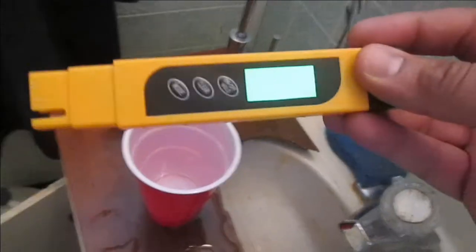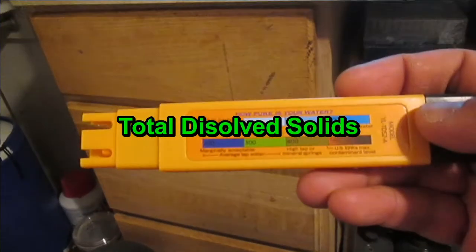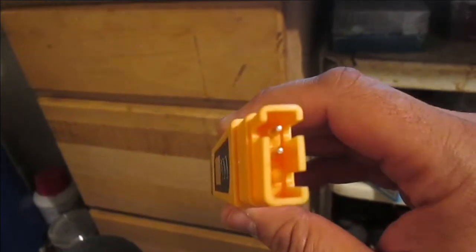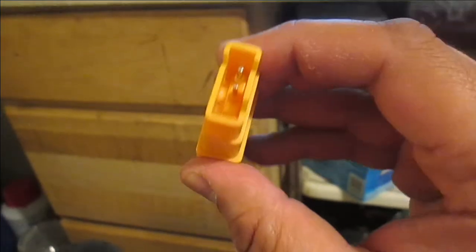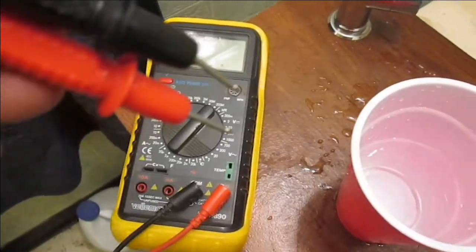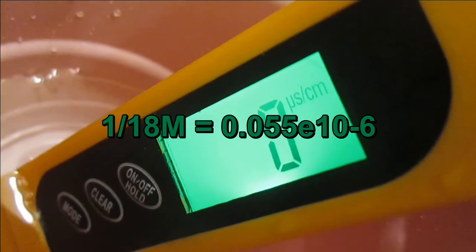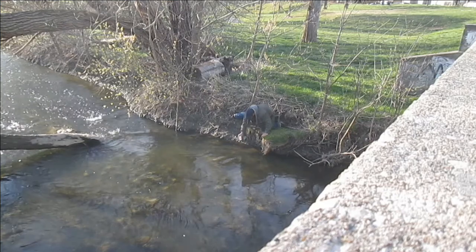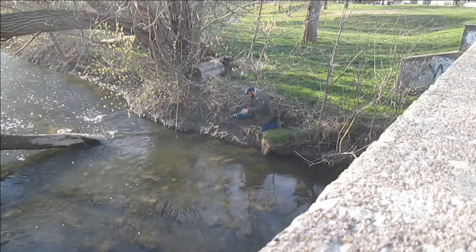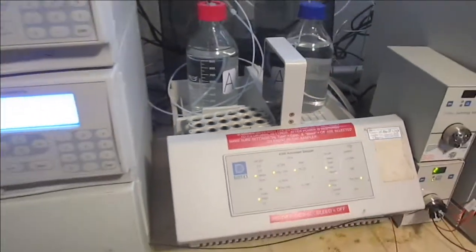Before I go any further, let me clarify one thing. I have seen many people using TDS meters with little or no understanding of their functionality. These are conductivity detectors that measure the water's electric resistivity between two prongs and mathematically invert the results. Pure water has a resistance at 1 centimeter of about 18 megaohm, and 1 over 18 million is 0.055 microsiemens. Although very helpful in the field, they give a good idea of the ionic concentration of both cations and anions combined, but they cannot measure any organic or biological contaminations. Therefore, they cannot determine if the water sample is safe to drink or not.